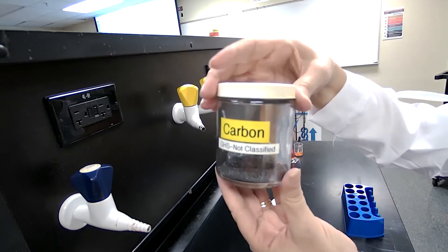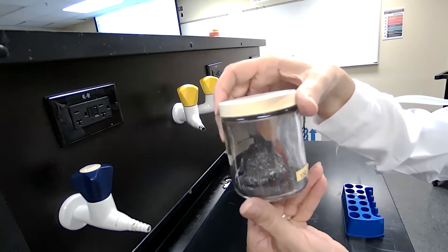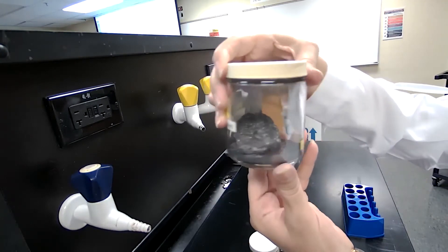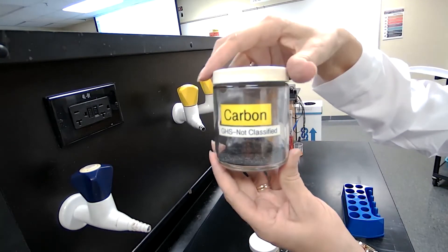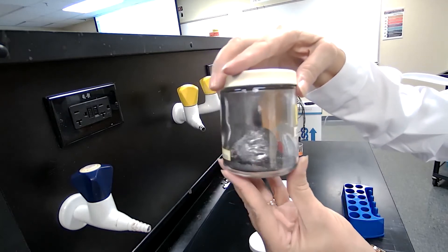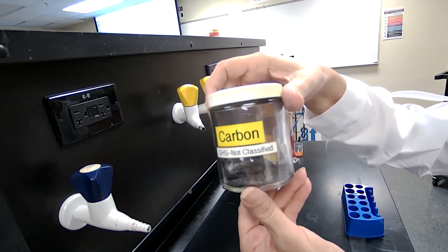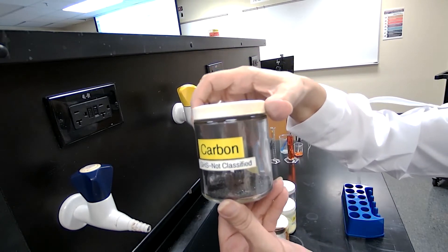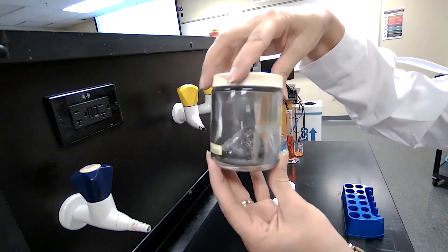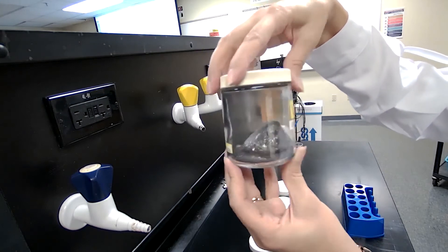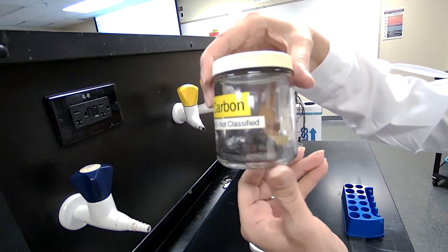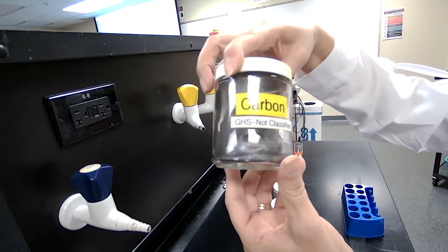When you are recording observations, you want to see what color it is. Is it going to be shiny? Is it not going to be shiny? And is it liquid or solid at room temperature? When you read the introduction for experiment two about physical property, you have a better idea what information you want to collect.